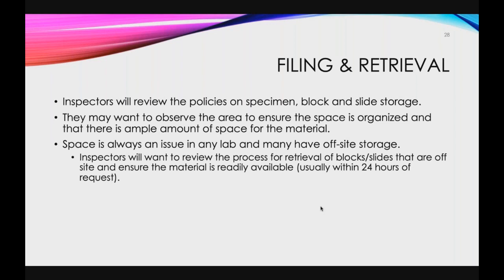Filing and retrieval is our next topic. Inspectors will review the policies on specimen, block, and slide storage. They may want to observe the area to ensure that there's enough space, which none of us have enough space, but as long as it's organized in a way that you're able to get what you need, they understand. Space is always an issue, and many have off-site storage.